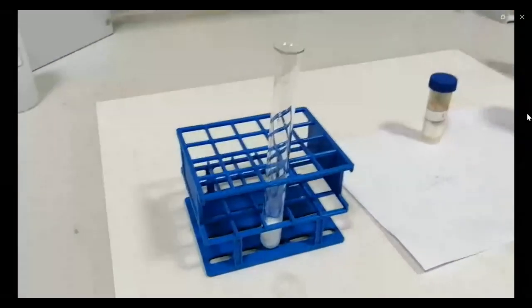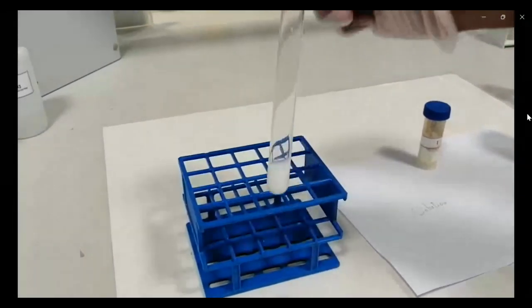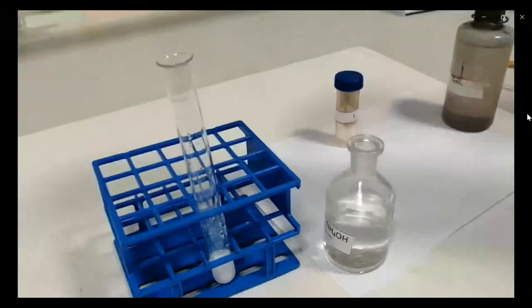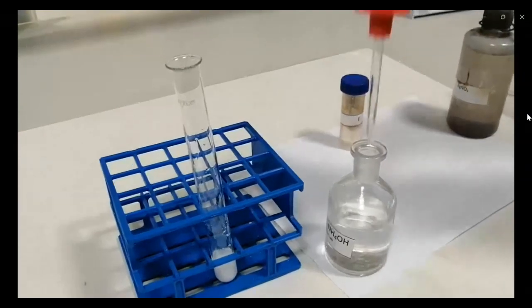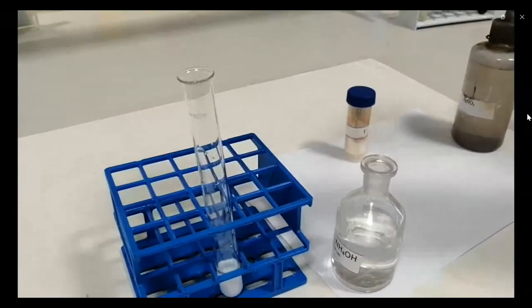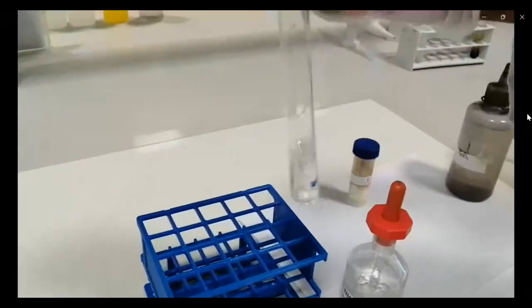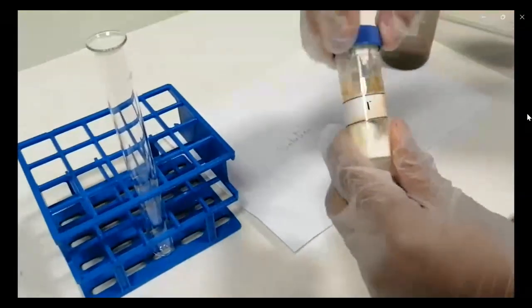You will see a white precipitate formed, which is soluble in ammonium hydroxide, AgCl. Once you add ammonia or ammonium hydroxide, a few drops, you will see this precipitate disappear. Just mix them very well with the ammonium hydroxide. You end up with a very clear solution, which means that the precipitate is dissolved in ammonium hydroxide.